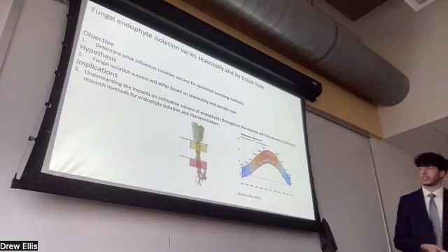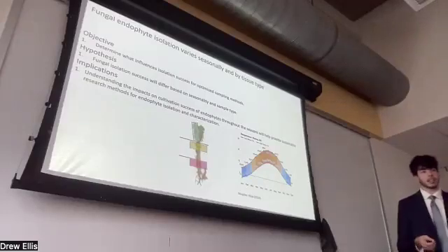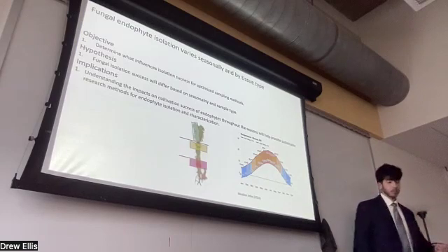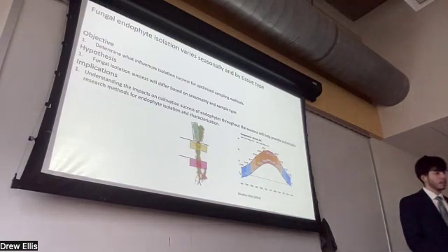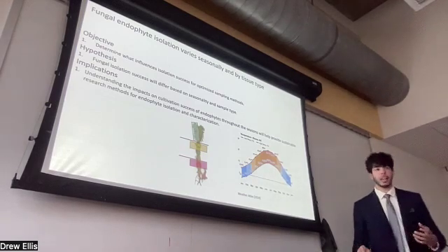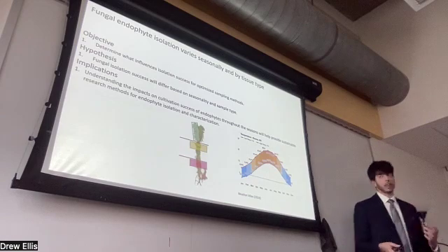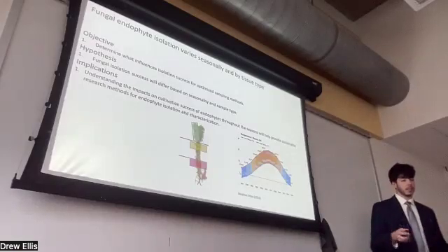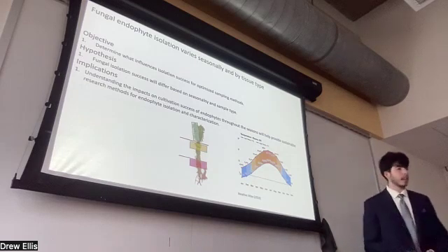Which leads us into our objective for the study. So we were trying to determine what's affecting this isolation success rate, and we're measuring that in numbers of fungi that we're getting outside of the plant, with the idea that some factors might explain this variation, such as seasonality and also tissue type specific factors. With the implication of, if we can determine what's causing this variable success rate, maybe we can target these specific seasons or tissue types and be able to more sustainably research these endophytes producing metabolites with a high success rate and reliable data at the same time.